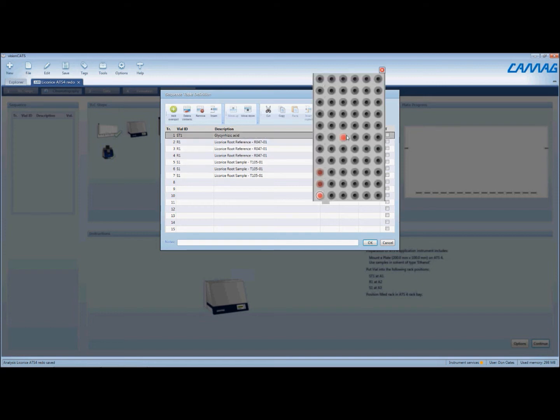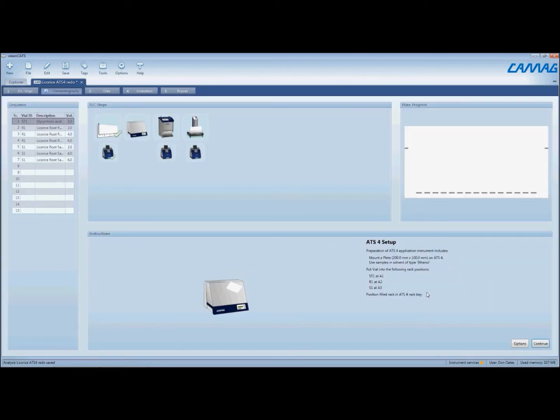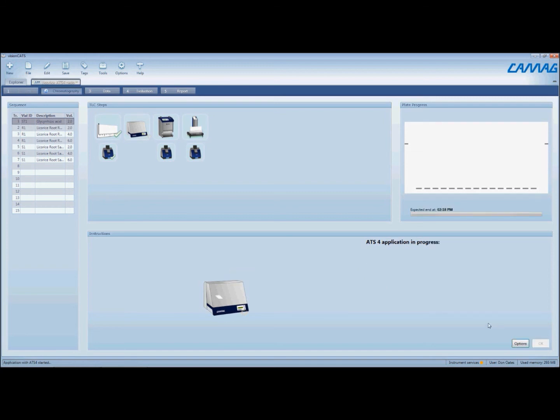Now everything is ready, so we're just going to click on continue and the instrument will apply the sample. As the sample is being applied, the software will tell you the progress and show you where the progress is located on the instrument — which track it's actually applying at the time. This updates while the ATS-4 moves along in the sample application process.